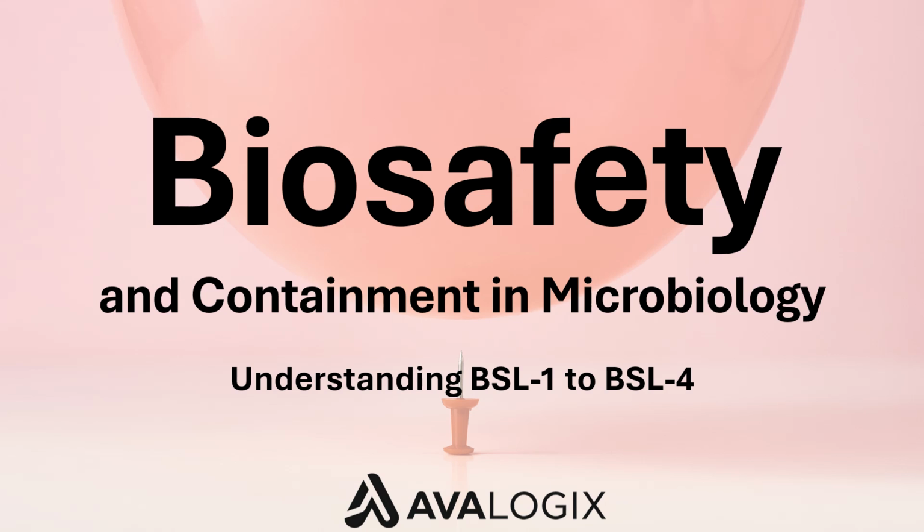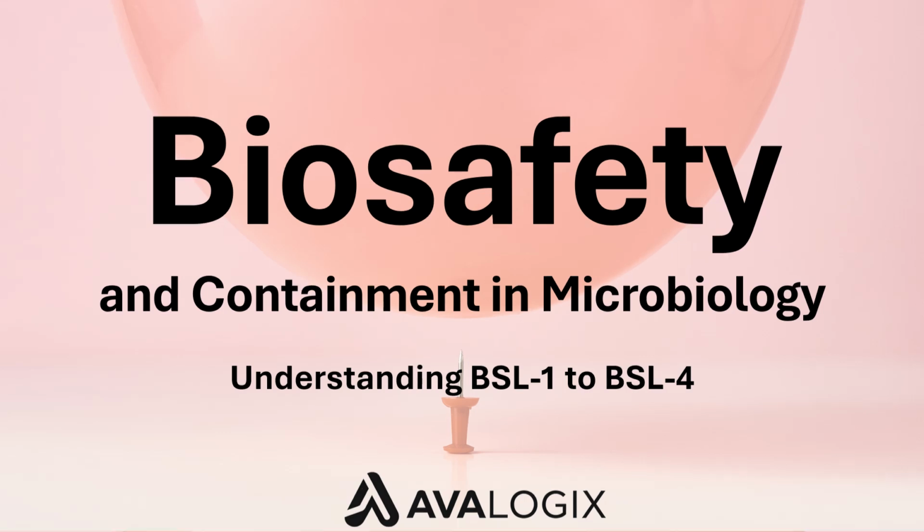In this lecture, we'll not only define what each level means, but also explore the laboratory practices, personal protective equipment, and facility designs required at each level. We'll examine real-world examples of organisms handled at each BSL and look at how biosafety intersects with both public health and regulatory compliance. So, let's begin by looking at the learning objectives that will guide our discussion.